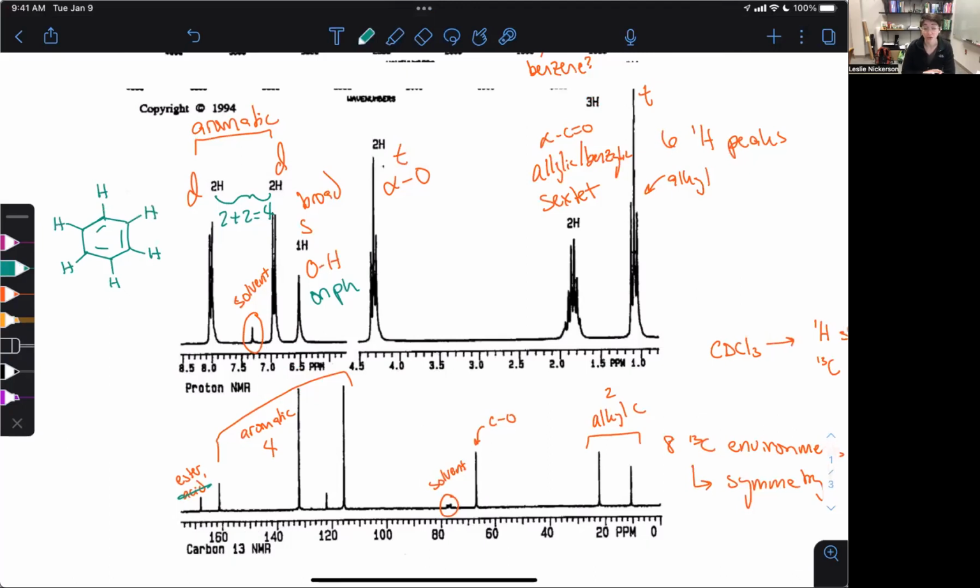There are 6 hydrogens on that benzene ring. Okay, if I end up integrating out to only 4 hydrogens, it seems like common sense, but it's very, very commonly overlooked. I must have 2 bonds to something, right? So that I have now 4. Okay, so that's what I want to be thinking of.